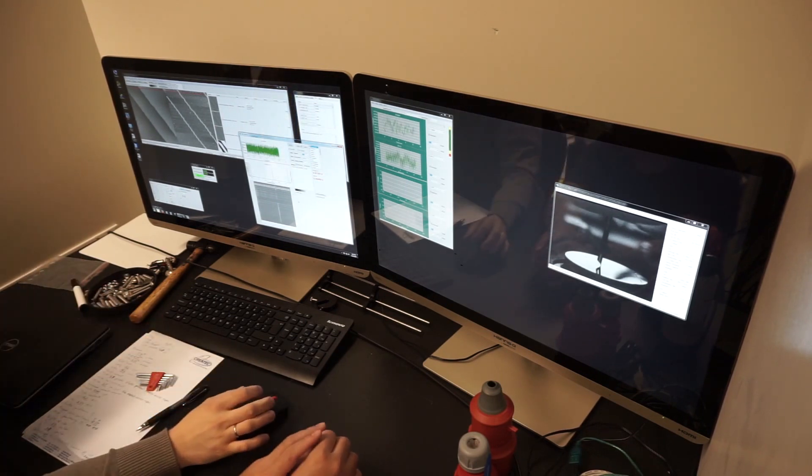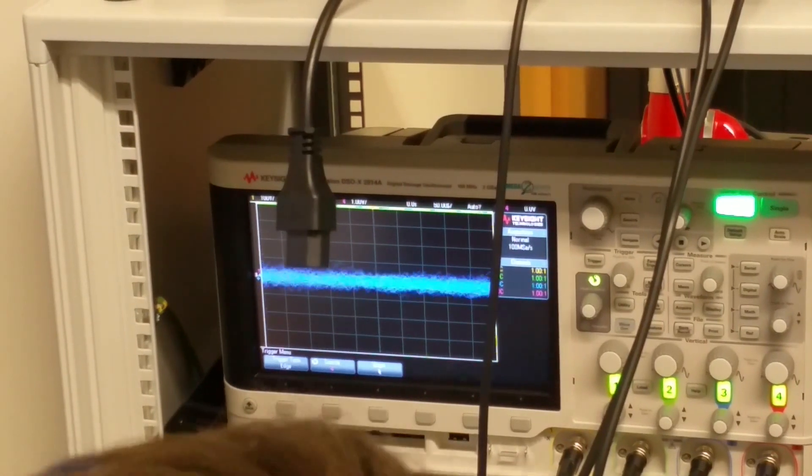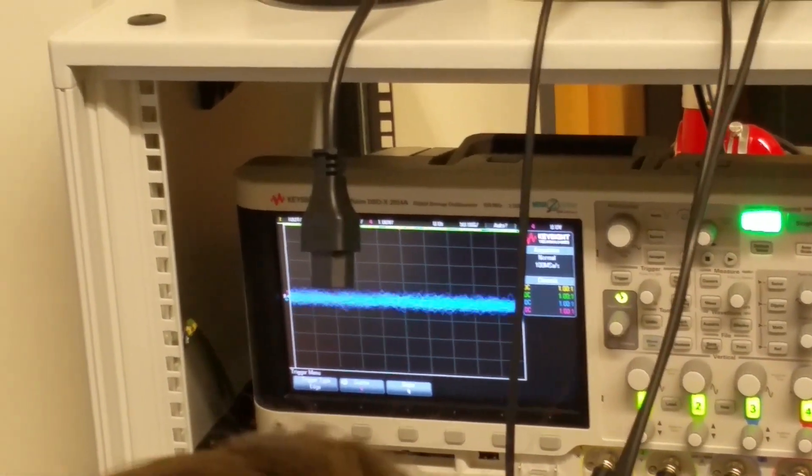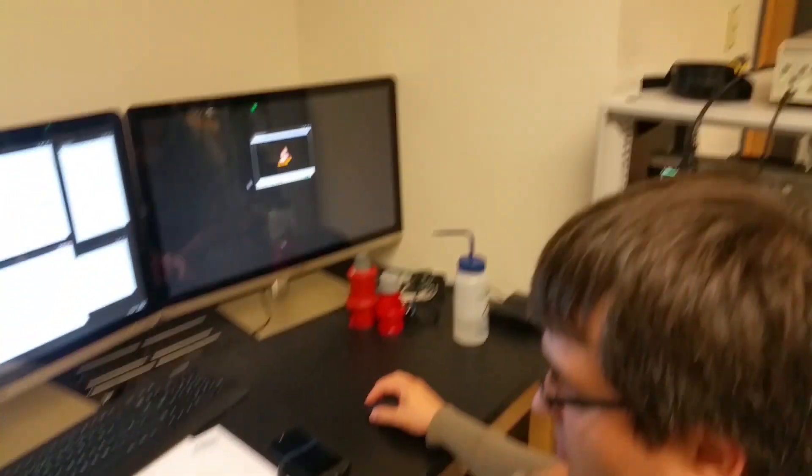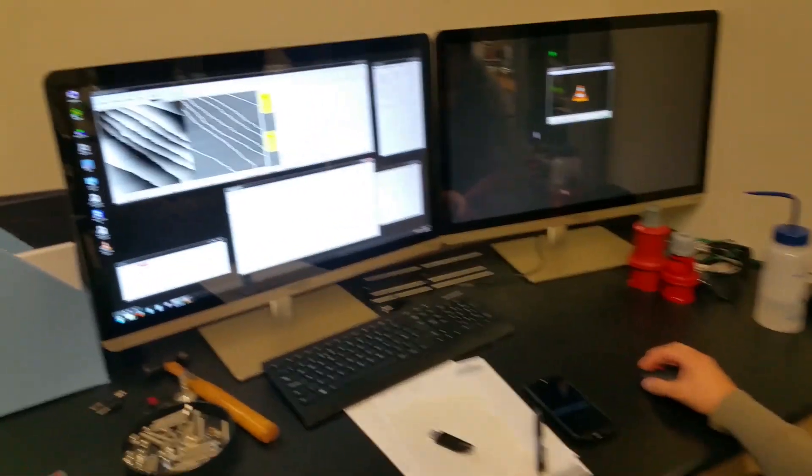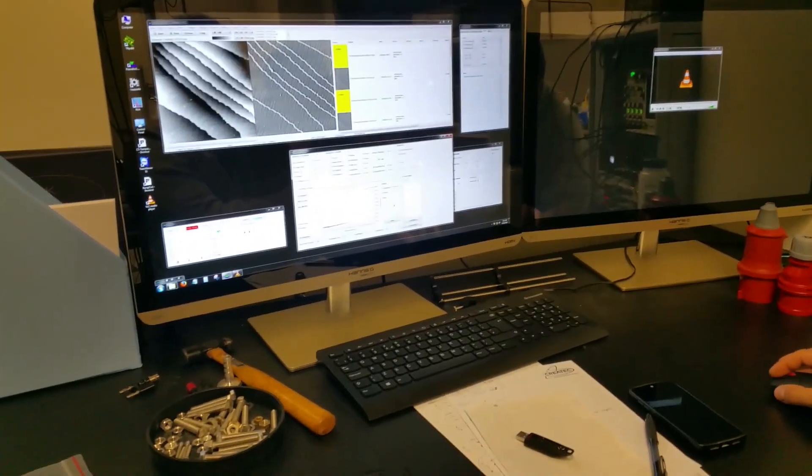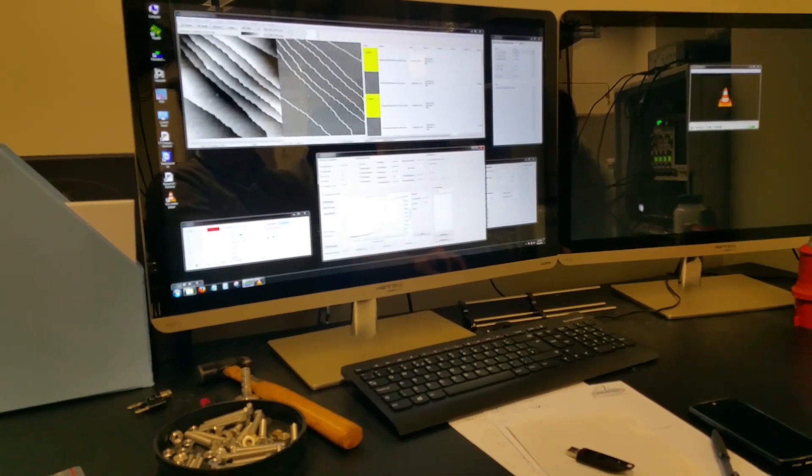So that way we get a good image. Let it cool down so the Q-factor will rise. What's the current Q-factor right now? 3,000.